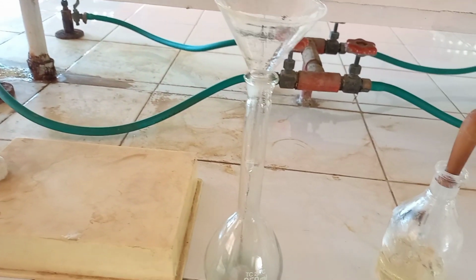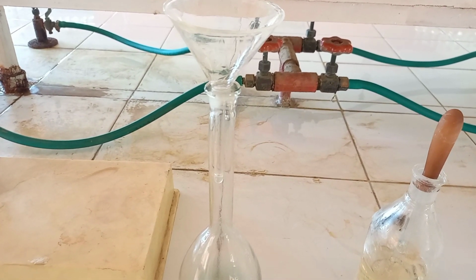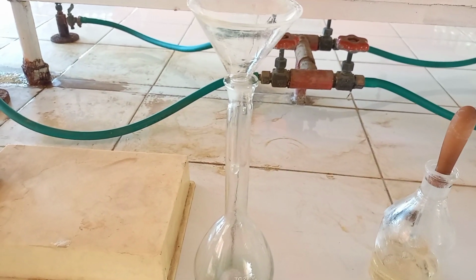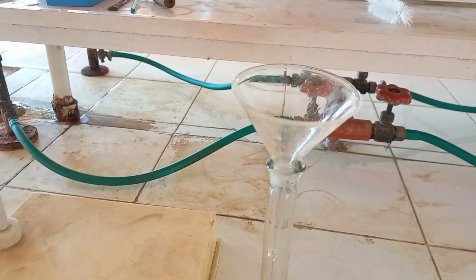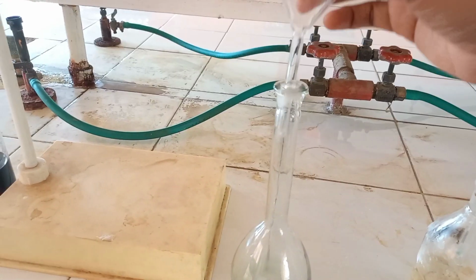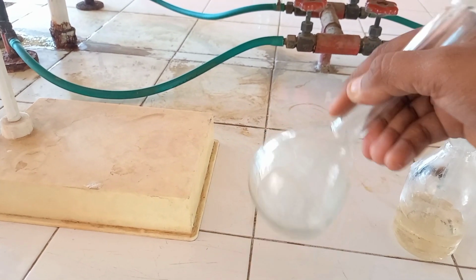After this, we will pour a very small quantity of water into this flask, so the salt gets dissolved in the water properly. You can pour the water in this manner, so if any particles are sticking on the funnel or on the watch glass, they can easily be added into the standard flask. So I added a very small quantity of water into it, then I removed the funnel, and then I am just dissolving this salt into water.